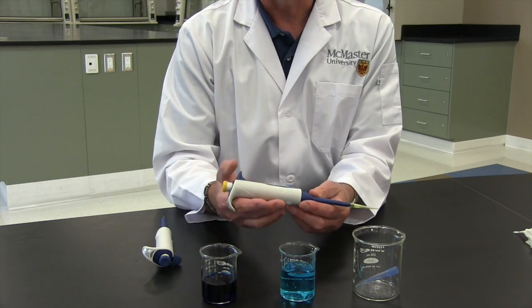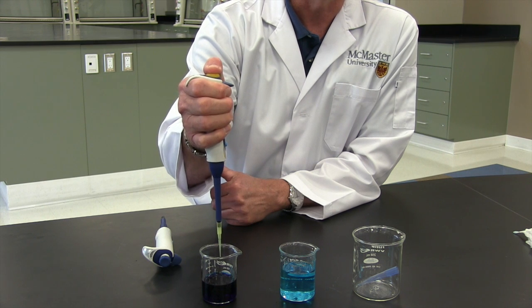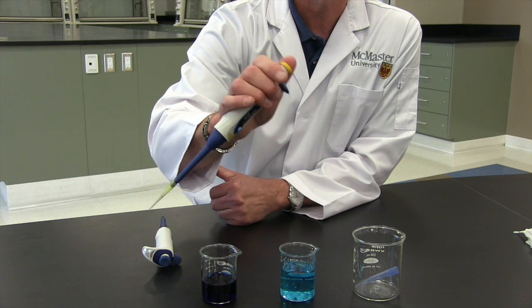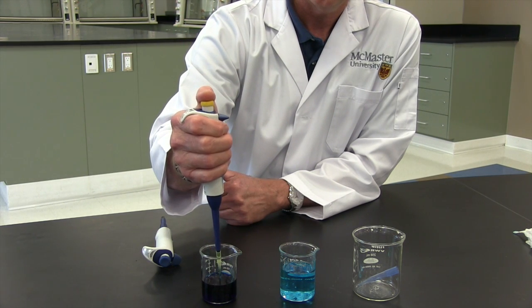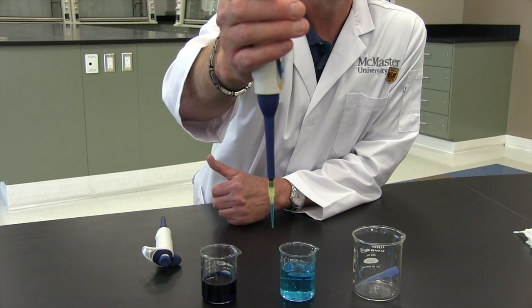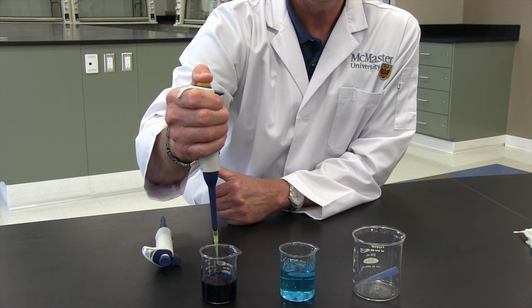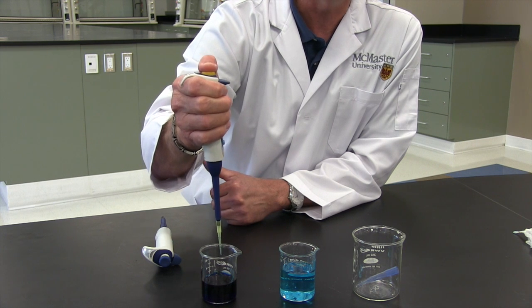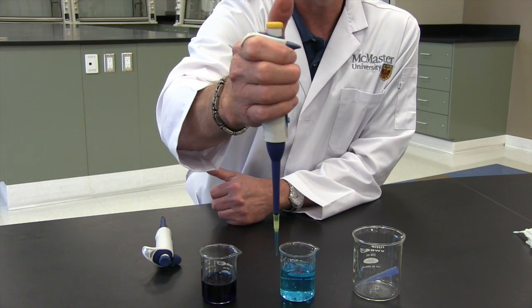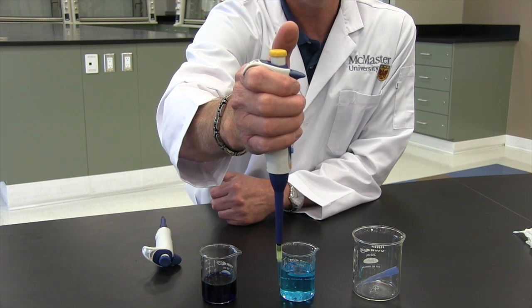Another common error occurs when you press down to the second stop when you want to draw up your liquid. As I mentioned, the first stop in this case is 50 microliters. If I draw up 50 microliters, I've put a mark on the tip so that you can see approximately what the volume is there. If I press down to the second stop and then draw up my volume, you can see the error that I've created. I've actually drawn up more than what I've set in the pipette.